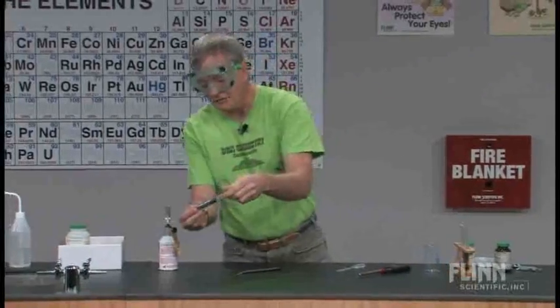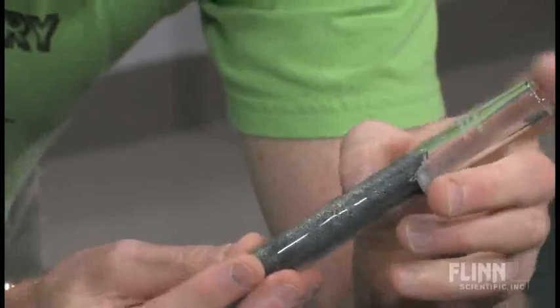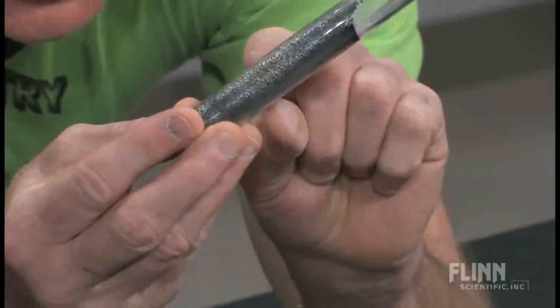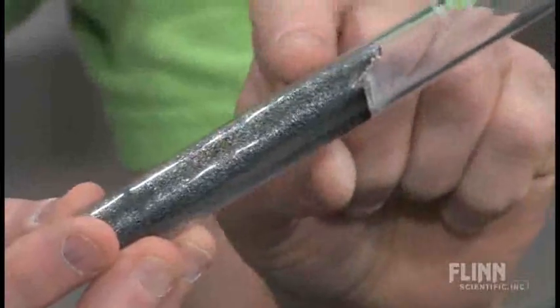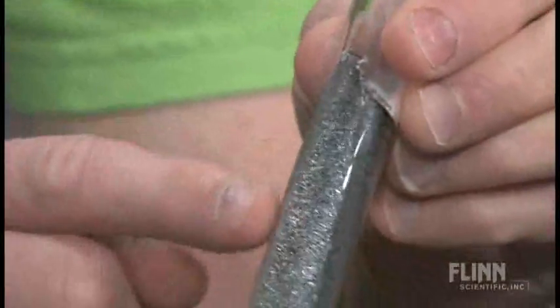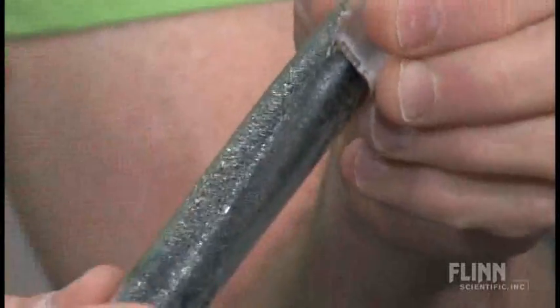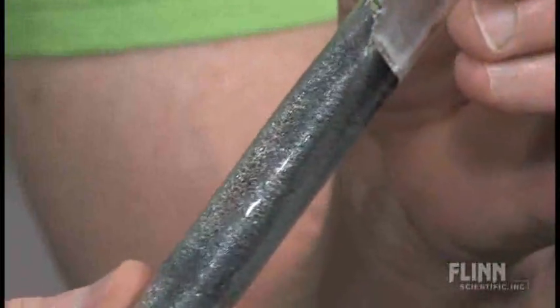here's what we have. And you can look at this test tube, and again, now I think you can really see on this one, same kind of test tube, how it's changed. You can see almost the mottling there on the inside, the bubbles. And you see this cool silverish glow on there, or silver color? Look at that and go, what the heck is that?